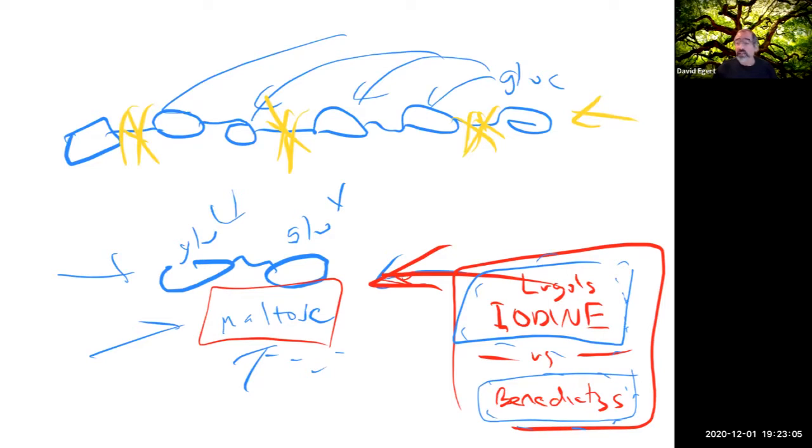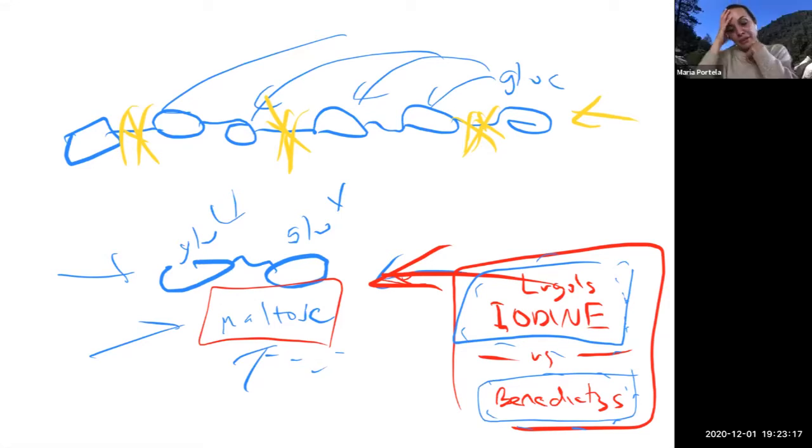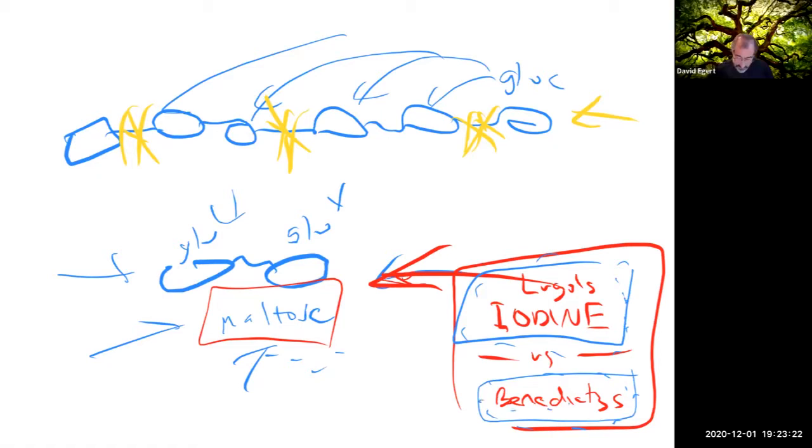What about if I had total digestion? Let's say the digestion totally broke down all of this starch. What would I see? In Benedict's solution would be greenish, orange, or red. Exactly. And the Lugol's, which is normally kind of a yellow brown, if it stays that yellow brown, that means there's no starch present. Kind of amber, maybe amber is like yellow brown.